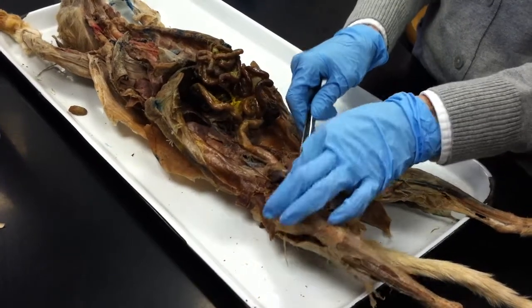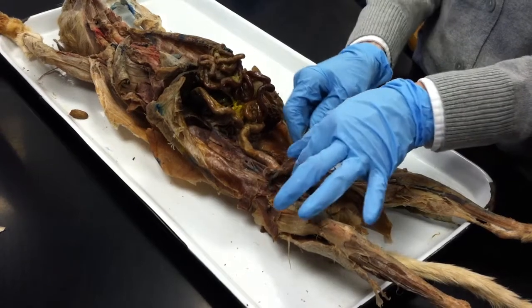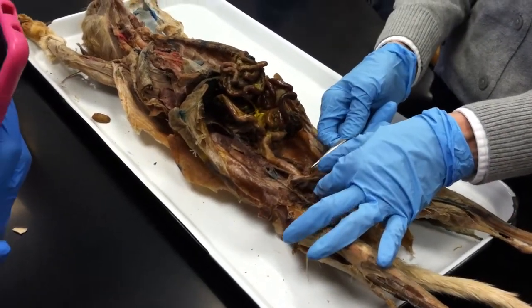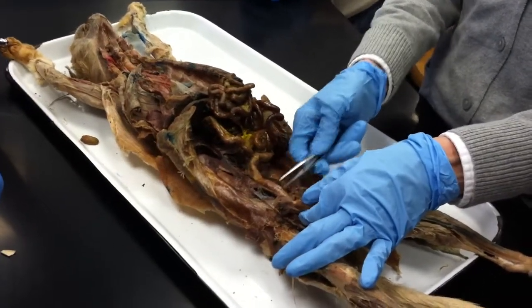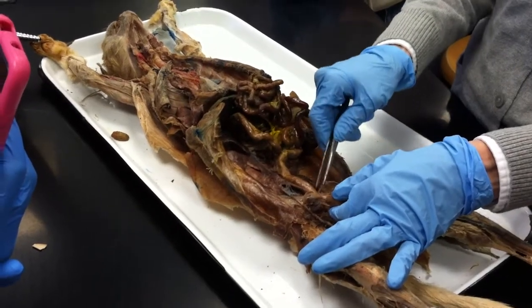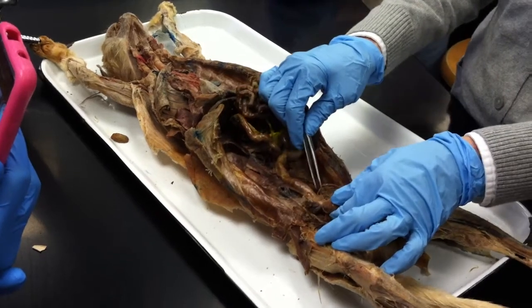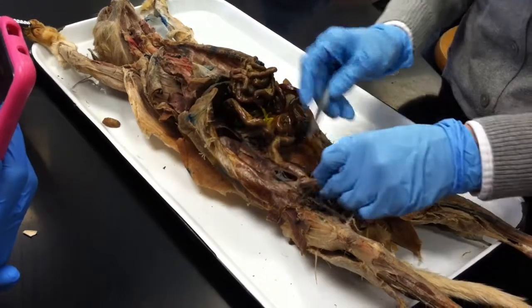Okay? And this, what I'm pulling on here, is his urinary bladder, right here. And this tube are the ureters coming down from the kidneys. Did you do this in lecture already? Yes. Okay. So these are the ureters. The spermatic cord comes through into the abdomen, crosses over the ureters on this side and on this side. See that? Okay. And then they come down.